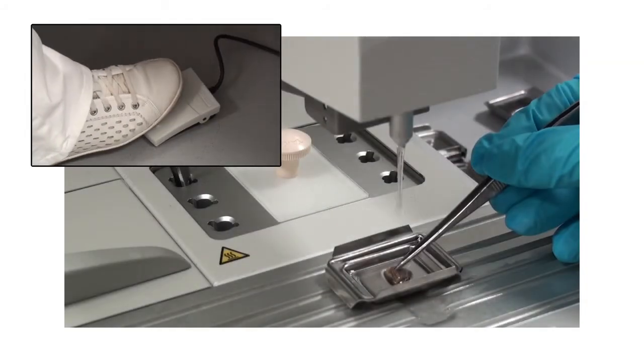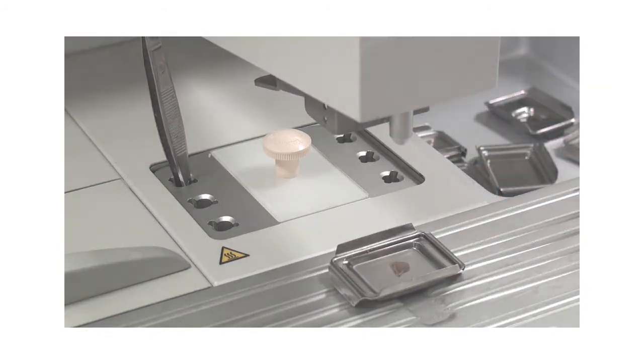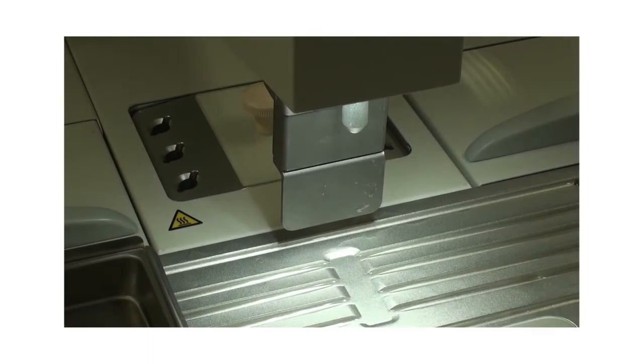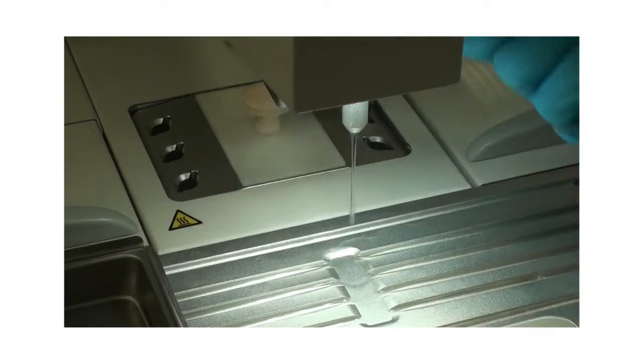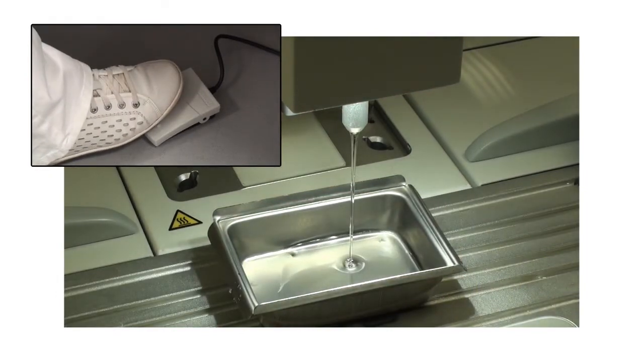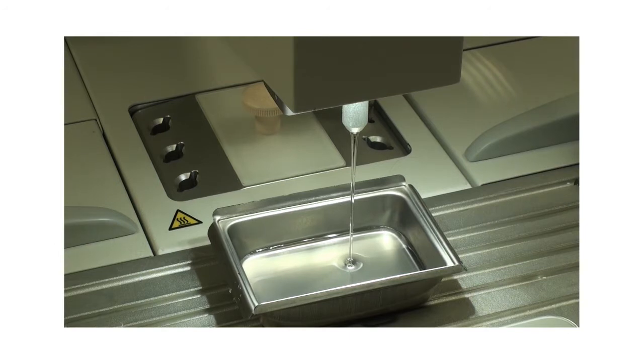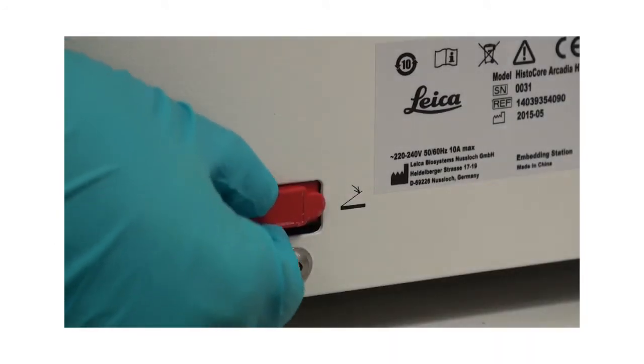The foot switch is an optional accessory that can be used to activate the dispenser valve, leaving the operator's hands free. If more space is needed to fill larger cassettes, the pressure clip can be folded backwards, and the paraffin flow activated via the foot switch. To connect the foot switch, insert the plug into the connecting port on the rear of the instrument and tighten the screws.